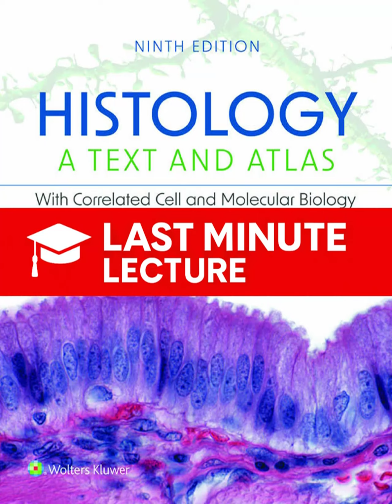So let's start with the acidic dyes, like eosin. What are they attracted to? Acidic dyes carry a net negative charge on their colored part. So naturally, they're attracted to and react with cationic groups in the tissue, things that carry a net positive charge. Which would be what? Mostly the ionized amino groups of proteins. And this chemical reaction is called acidophilia, which just means acid-loving. So eosin stains things pink because those structures are full of protein and have a positive charge.